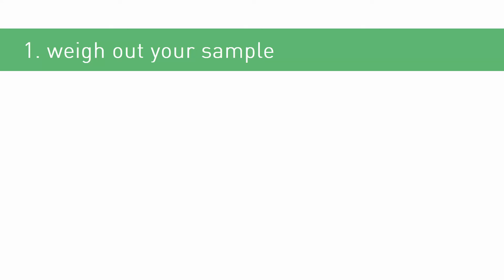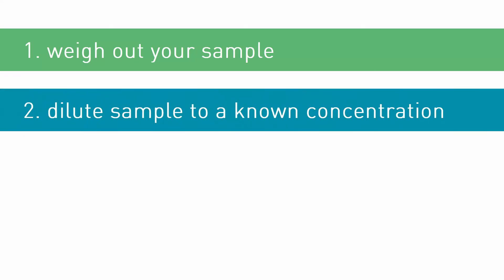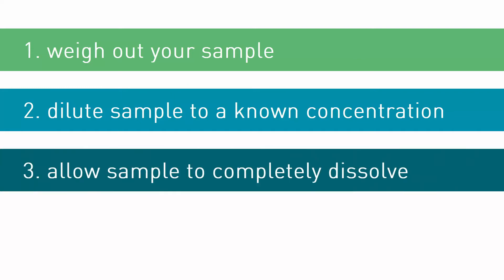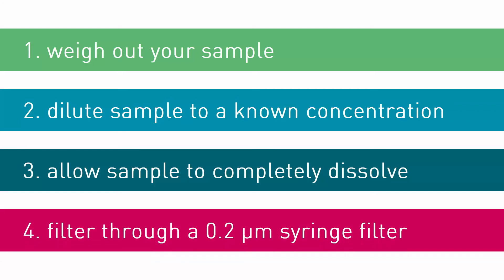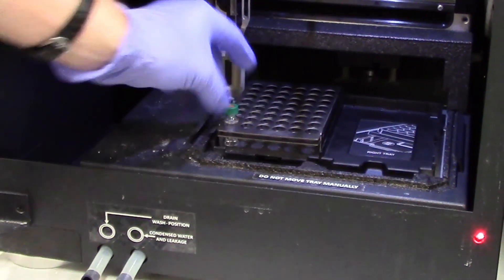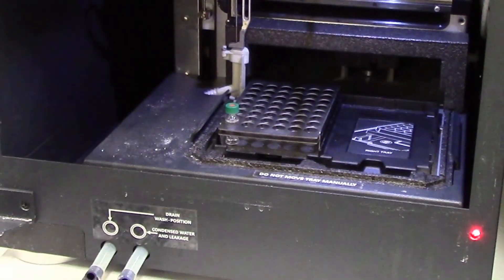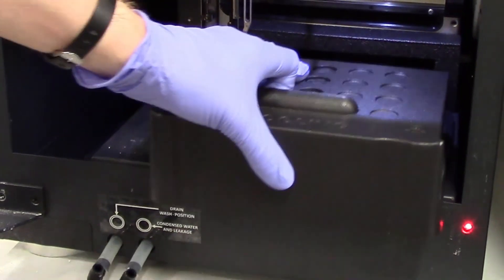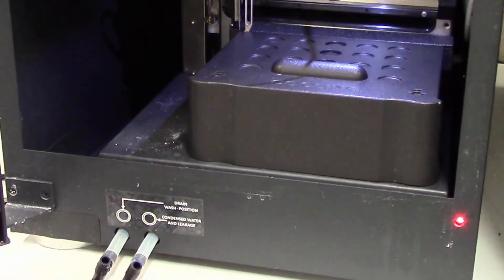So to recap: weigh out your sample, dilute your sample to a known concentration, allow your sample to completely dissolve under appropriate conditions, and filter your sample solution through a 0.2 micrometer syringe filter. Your sample is now ready to be injected into your GPC-SEC system. Good results are on their way.